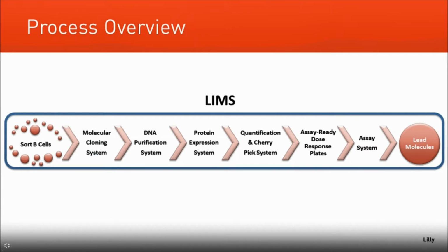We have several antibody discovery platforms at Lilly, and the one specifically I'm going to touch on today is an immunization-based platform using single B cells and going through a series of automated platforms to generate lead molecules. We have several other platforms, as I mentioned, that are orthogonal to this approach that we use for antibody discovery as well.